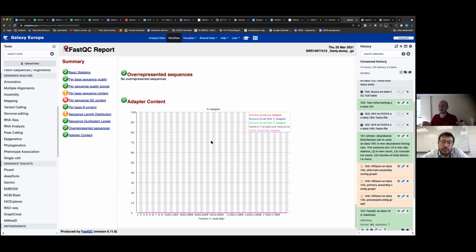Maybe you don't know that there is a symbiont as part of the sample that you sequenced and assembled, and you have organelles from the symbiont, or the entire genome of the symbiont, submitted at the same time. So they also have these contamination screenings to see if you're actually submitting multiple species at a time rather than a single species.